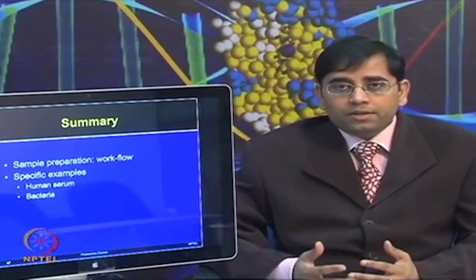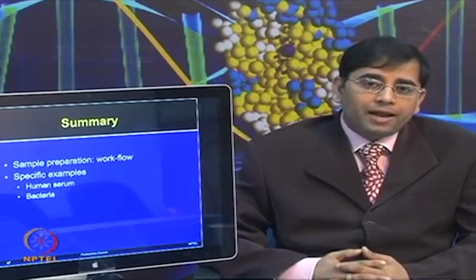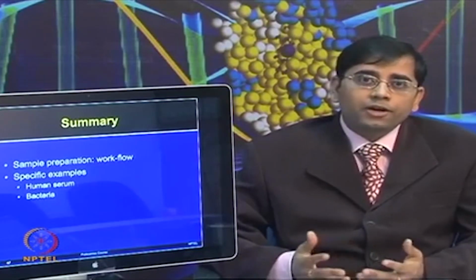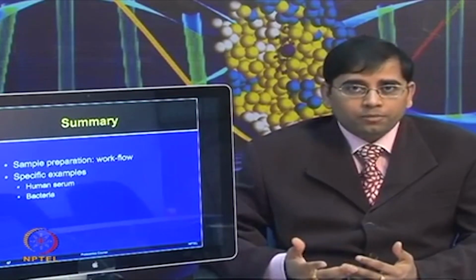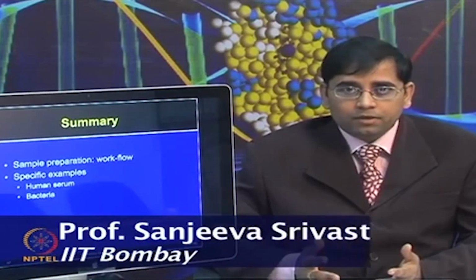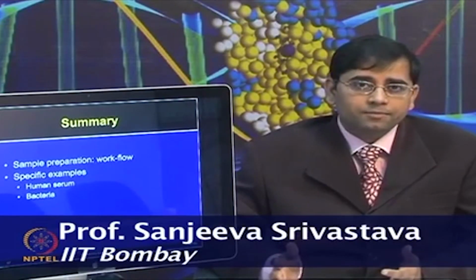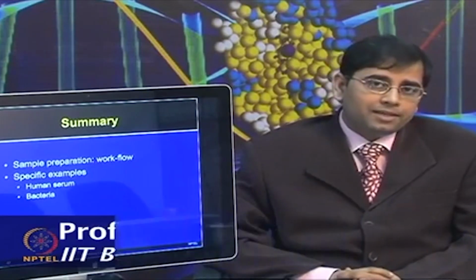We will continue our lecture, and in the next class we will talk about plant proteome analysis, followed by quantification. And once you have obtained a very good quality and quantity of the protein, then you are ready to perform the proteome experiment by using different techniques. Then we will start discussing two-dimensional electrophoresis and other gel based proteomic technologies, and in subsequent lectures we will talk about mass spectrometry based methods.